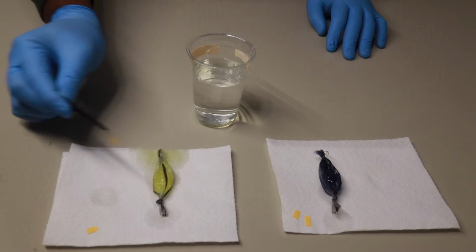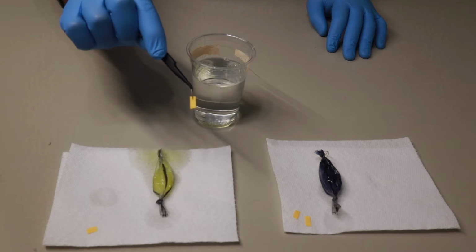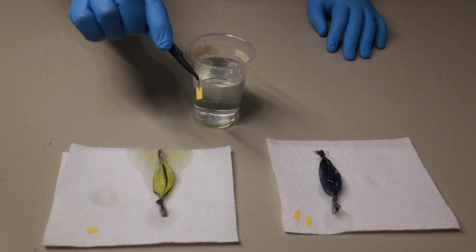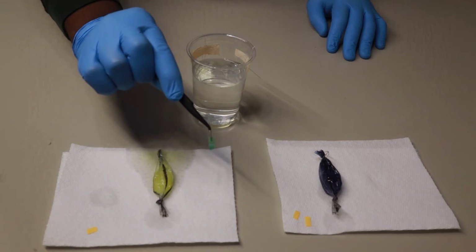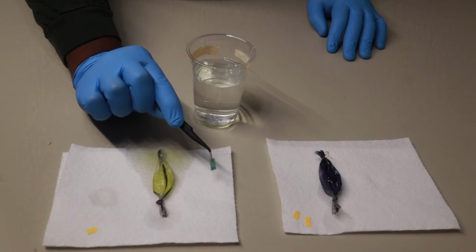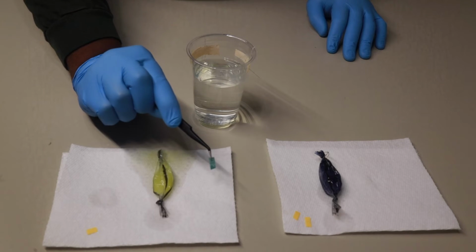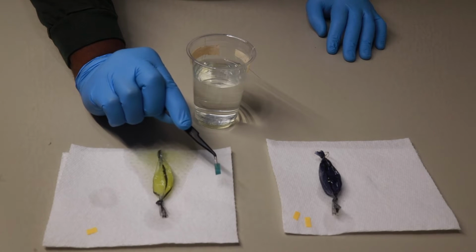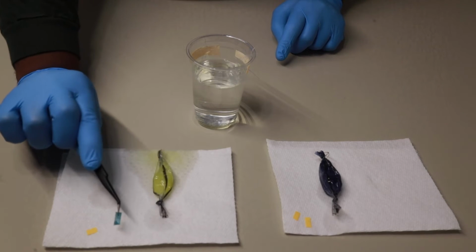After you've taken your bags out, you want to test the glucose level of the different solutions. So we first will test the cell environment to see if there's glucose in the cell environment. So with our indicator strips, if they remain orange, that means nothing happened. But if they turn a certain color, that means they detected what they were meant to detect. So in this case, we're looking for glucose, and we see there's glucose in the cup solution.